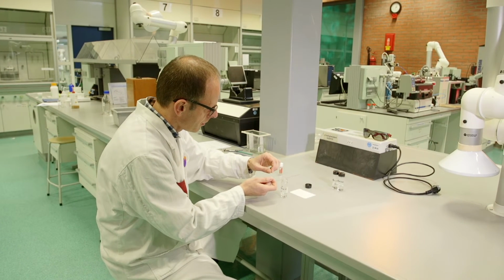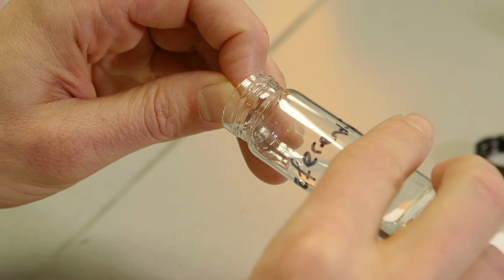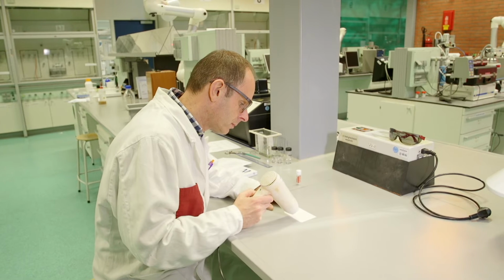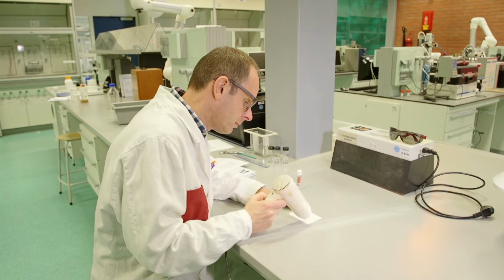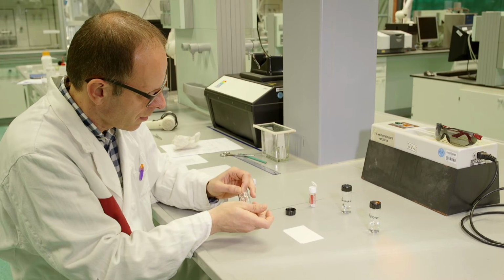Using a capillary or microliter pipette, a small amount of sample is applied to the line. After the solvent has evaporated, the sample can be applied 1 or 2 more times. A hairdryer can be used to speed up the evaporation of the solvent. A UV lamp can be used to view the sample.